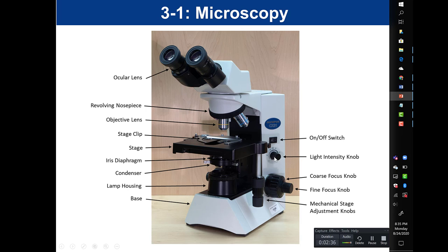We have our light intensity knob, also referred to as the rheostat. Our microscopes also have an on-off switch. These are the various parts of the microscope that you need to be familiar with.